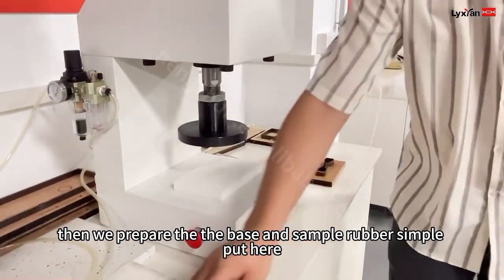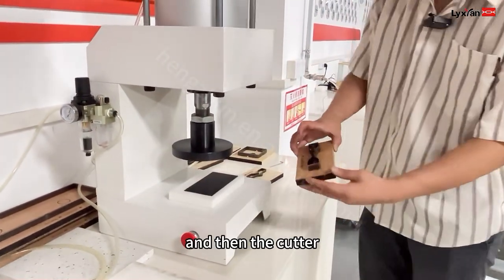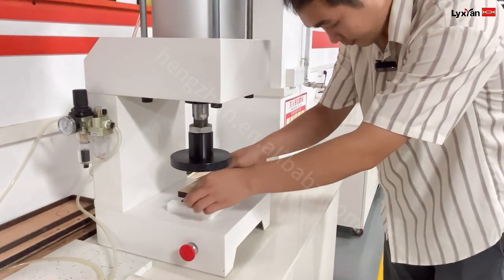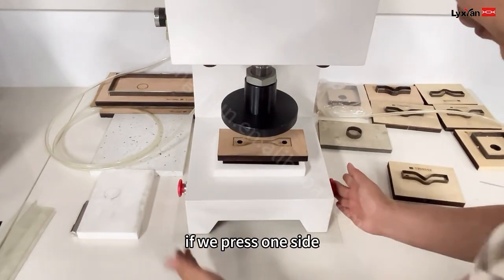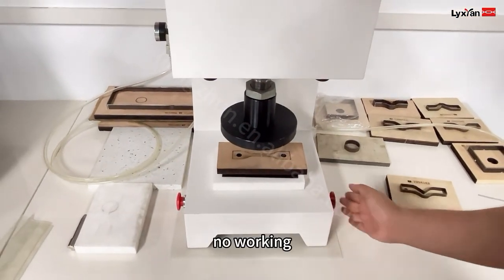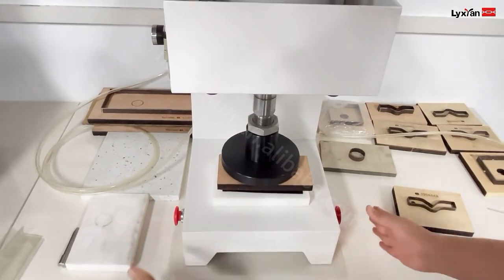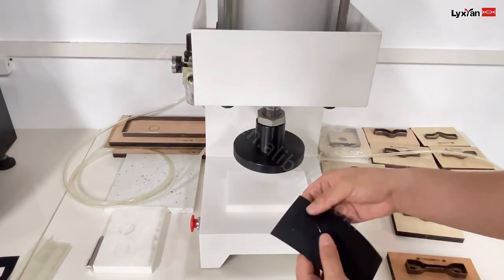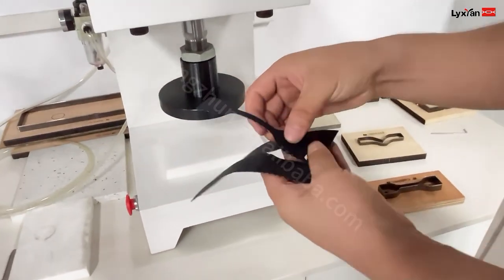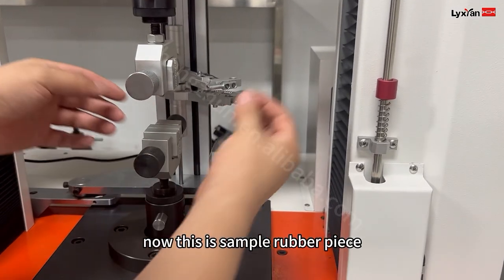Now we prepare the base and the sample — a rubber sample. Put here. And then the cutter. This machine, we need to press both sides together for the machine to work. If we press one side, it's working. So we press together. Now sample making is finished. Now this is the sample — a rubber piece.